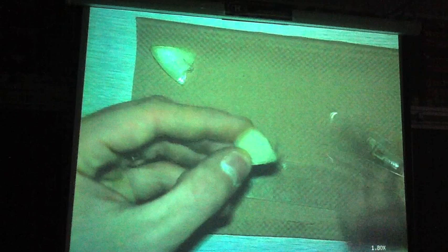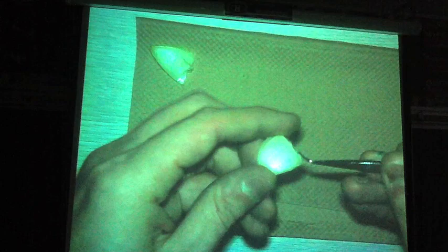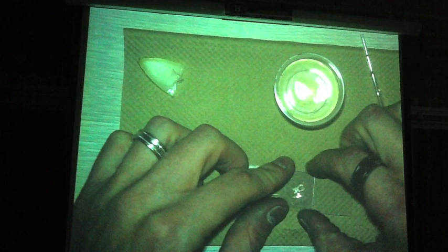Preparing onion samples. The best way to create your sample slide is snapping off a piece of the onion like this. What you want is the inside of the onion. Once you break off a piece, you can see a little film. This little film is what you want. You want something very thin, because the last thing you want is cells overlapping on your slide so you can't see them clearly. With my pipette, I will get some water, and you only need about one or two droplets in this water mount. Then grab your cover slip at a 45 degree angle, and drop it down.